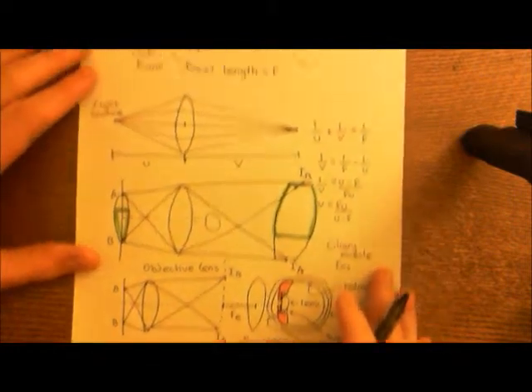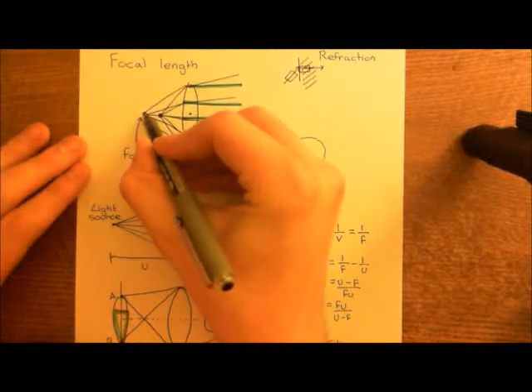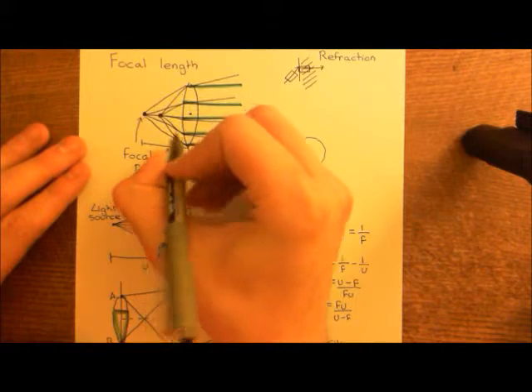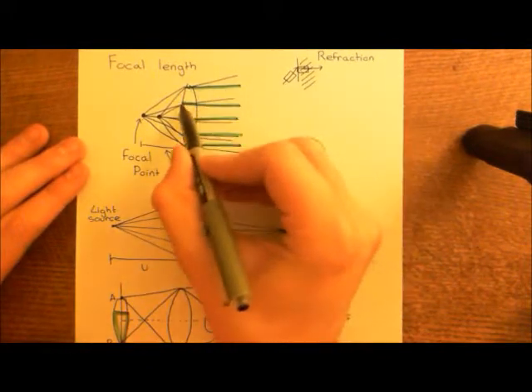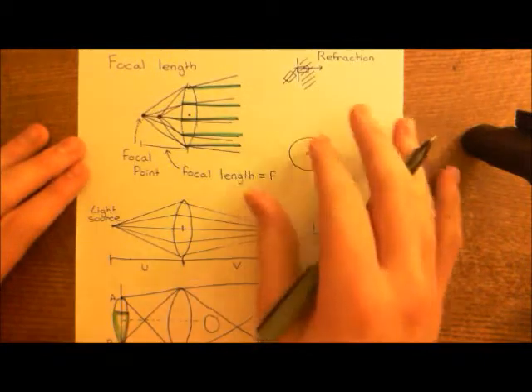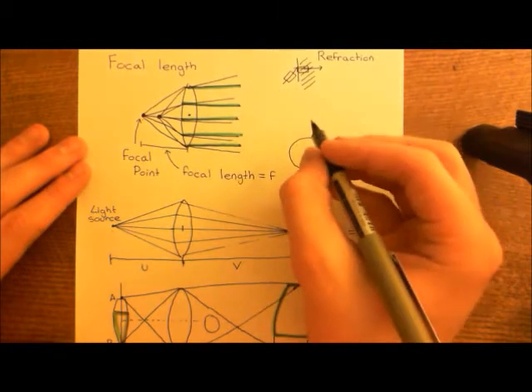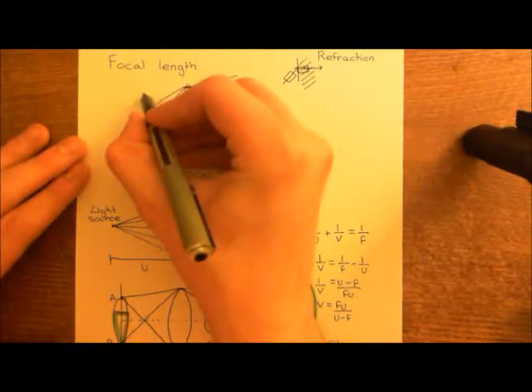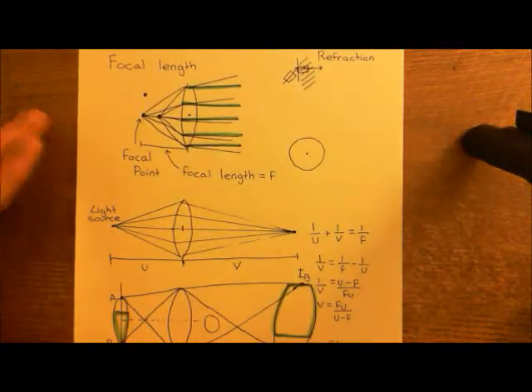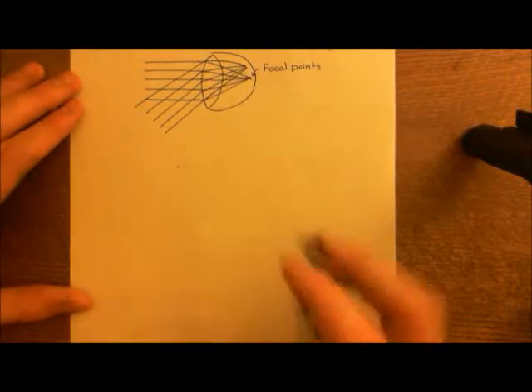Now, previously, we have only looked at the point source of light being actually at the center of the lens and sending out all of its light beams. And then what happens is the lens will, sorry, not diffract, refract them all, so that they're all running in parallel. Now, what happens if the point is somewhere up here, but is still the focal length from the lens? Well, let me draw that out over the way, because obviously we're going to need that.